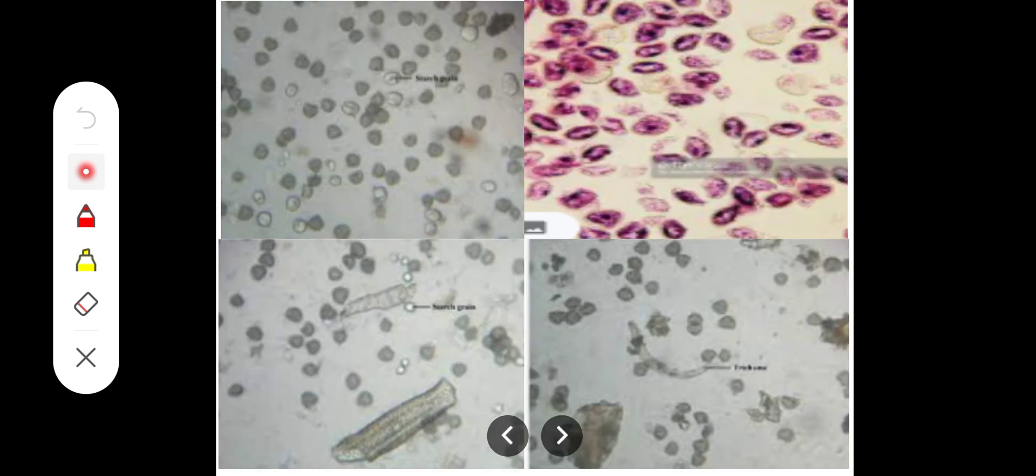It will look like this. You can see the dark ones are the Lycopodium spores and the light ones are the starch. In the starch grains, it looks light, like white rubber. This is the starch grain.